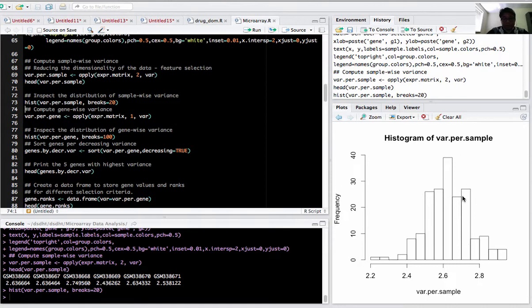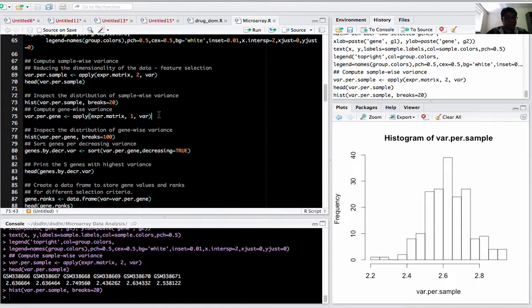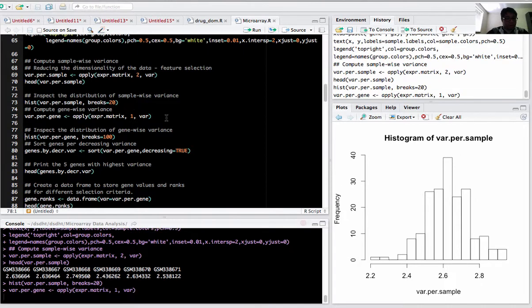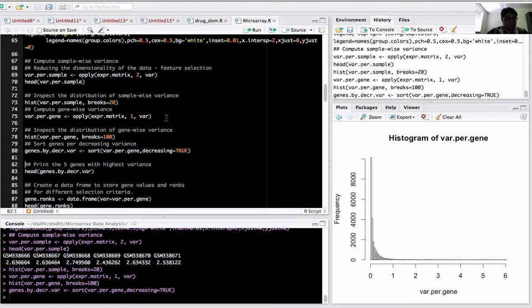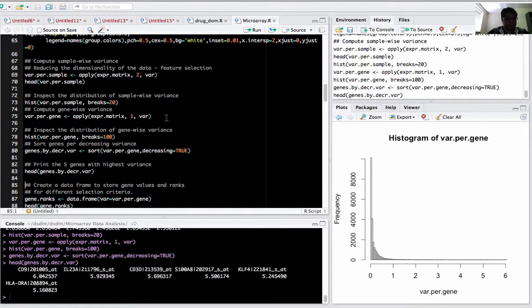For gene-wise variation, I replaced the 2 with 1. If you want to plot it, it's very highly skewed. Then I sorted the genes by decreasing variance and printed the five genes with the highest variance. CD9 and IL23A have the highest variance among the 190 samples.